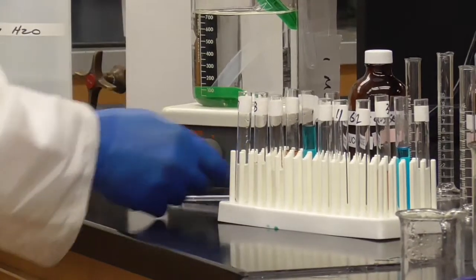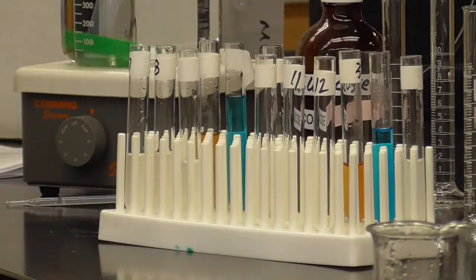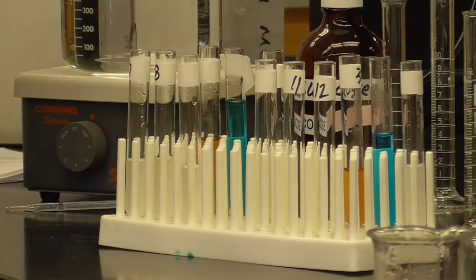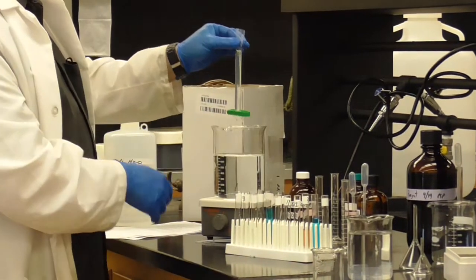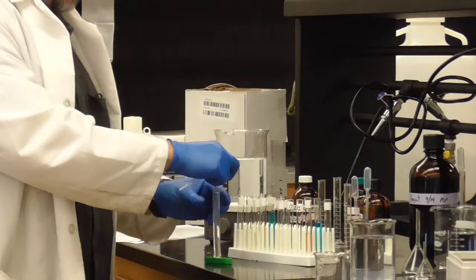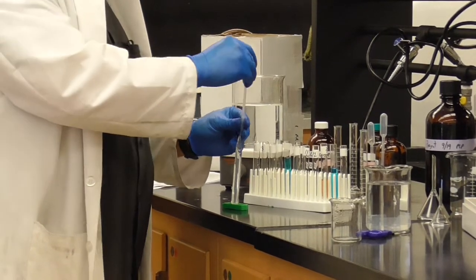Okay. And then finally in tubes 10, 11, and 12, what we're going to do is to test our solution. So break this back open again and test that as well. So let me open up this clip. There we go. And we'll just dip right down into here and get 3 milliliters in each one of these last test tubes. This is kind of floppy, not the easiest thing to do. All right, here we go.